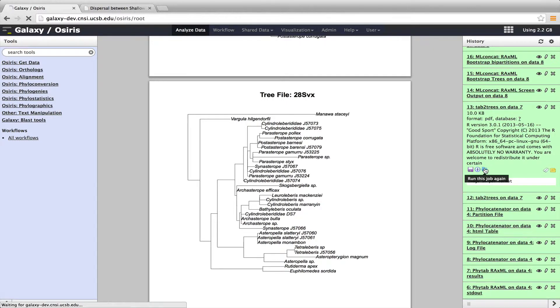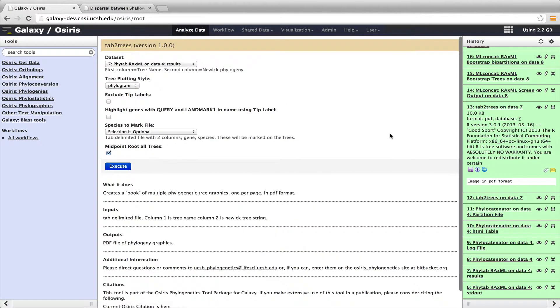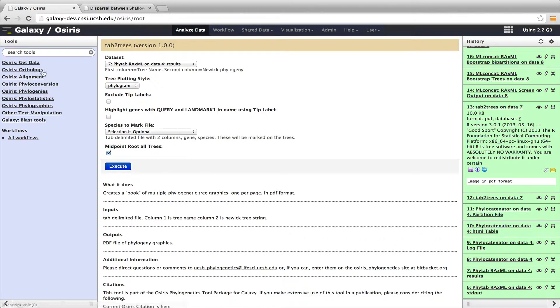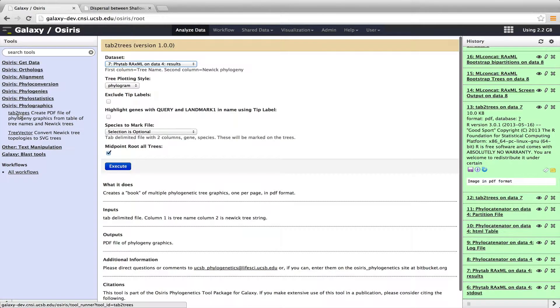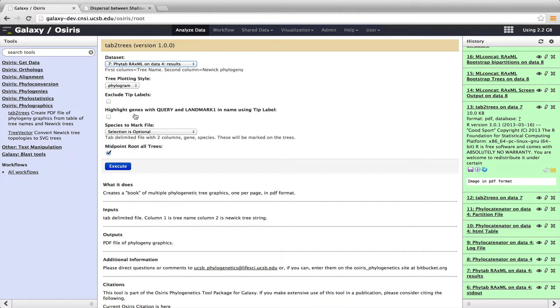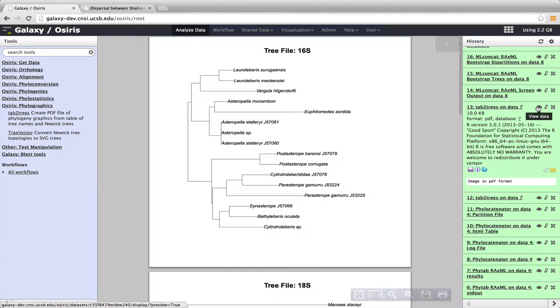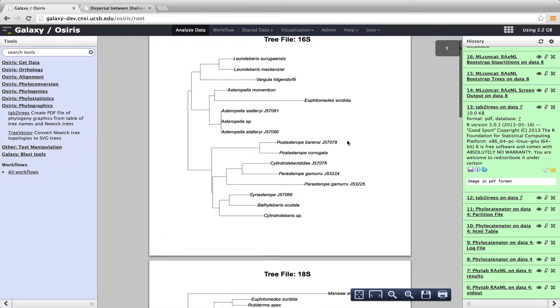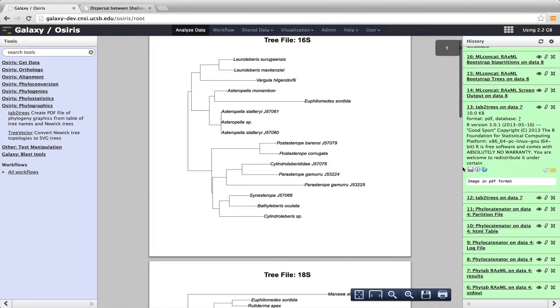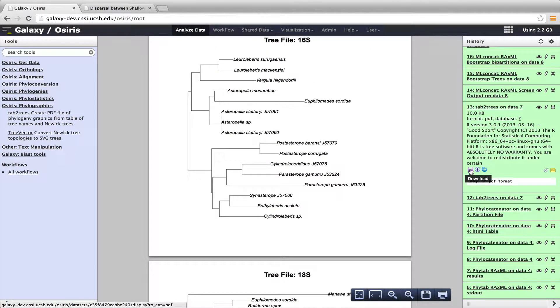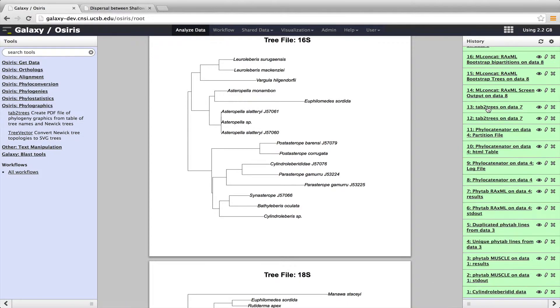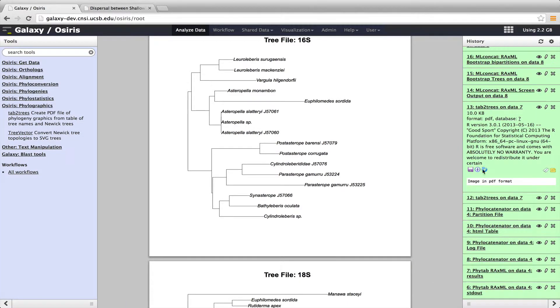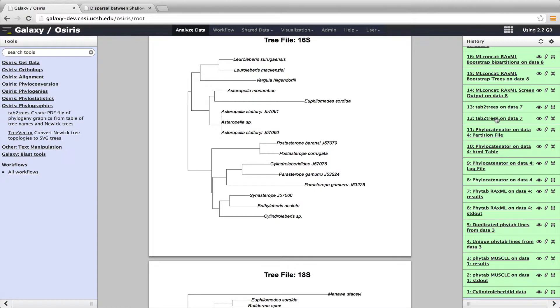So let me show you what it looks like if we were to run Tab to Trees. And again, all these different tools we can choose over here. So Tab to Trees is under phylographics right over here. So we can do Tab to Trees. And we can see we have different options here. So I had midpoint rooting chosen. So all those trees were midpoint rooted in this book of PDFs. We could also download this data and get it to our local machine. So we can download this PDF by just clicking on this disk here, which is in this area of the history. So that's phytab-raxml.